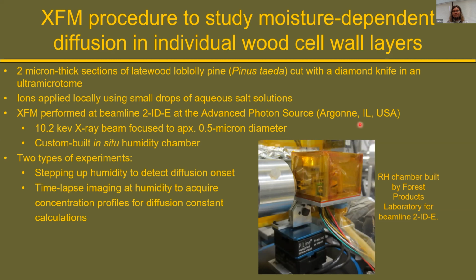To do these experiments, we use 2 micron thick sections of latewood loblolly pine. We apply some ions locally using small drops of aqueous salt solutions. I'm going to show results from 2 different experiments. In one experiment, we're stepping up the humidity to detect the diffusion onset. In the second set of experiments, we're going to do time-lapse imaging at constant humidity so we can acquire concentration profiles to measure those diffusion constants.